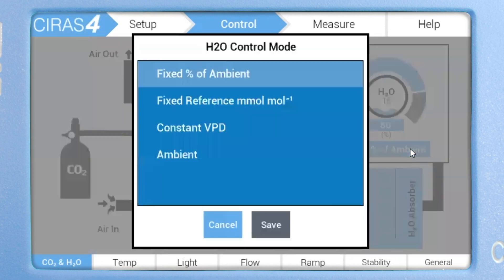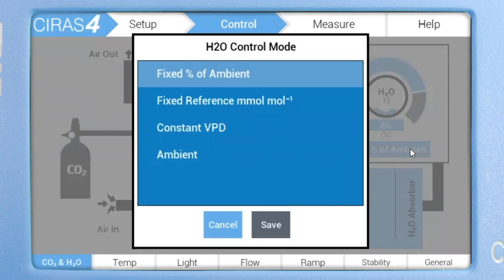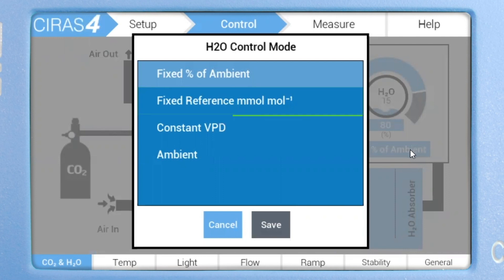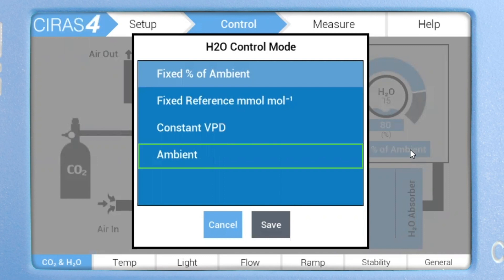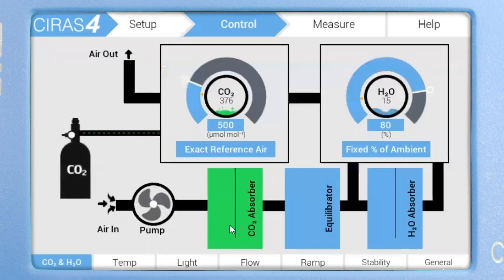Now let's have a look at H2O, which also offers four control options: fixed percent of ambient, which is very common; fixed reference millimoles per mole for users that want to work at a specific H2O concentration; constant VPD; or ambient. As with the CO2, you can use the slider to set the H2O concentration or manually enter a new value. Let's leave it set to fixed percent of ambient at 80% control.